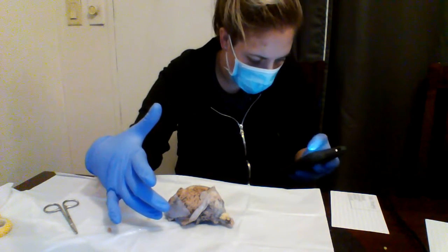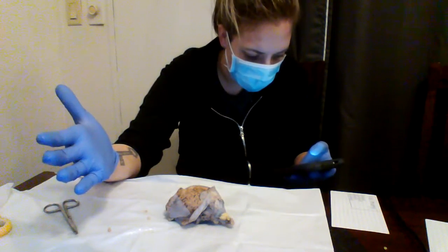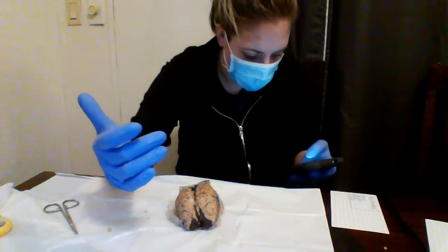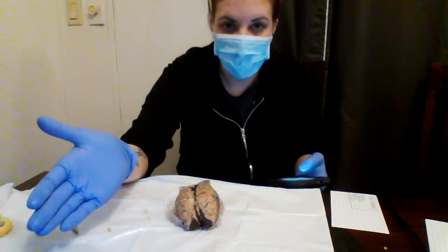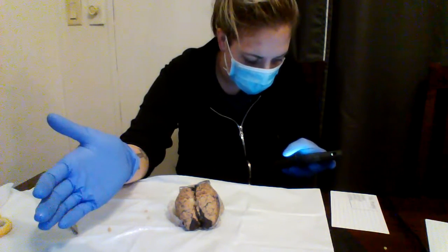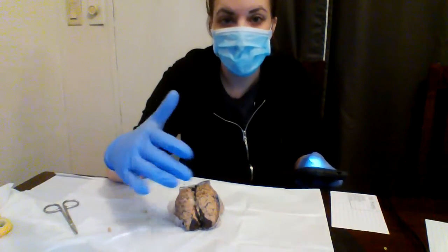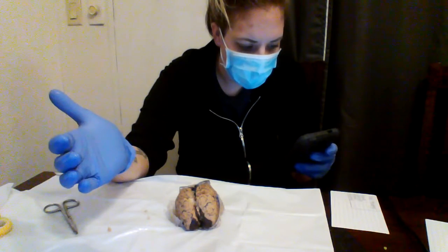So basically, as far as the half of a human brain goes, we have our frontal lobes, the parietal, the temporal, and the occipital. It's a little bit different on the sheep brain because it's a little bit longer and ours is wider. Same concept though.